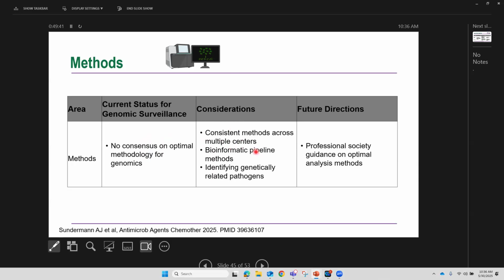We have developed these using publicly available tools and automated pipelines. So every week when we get our sequencing results back, we go into this automated pipeline, and very quickly we get the clusters for that week. And we typically have at least 2 or 3 new clusters every week, but you have to have a commercial product that will do this for hospitals.